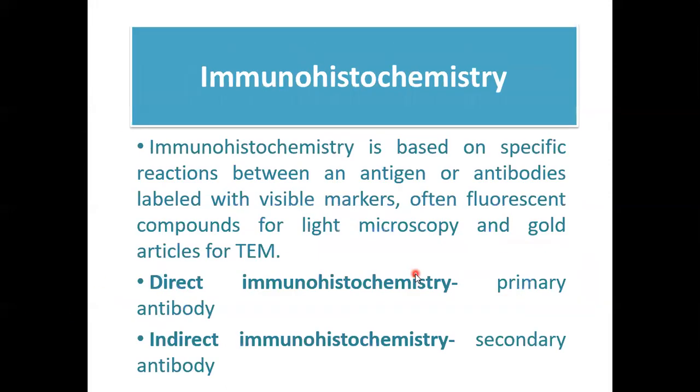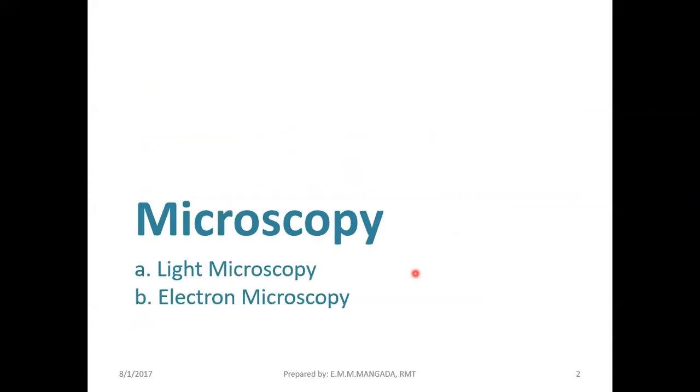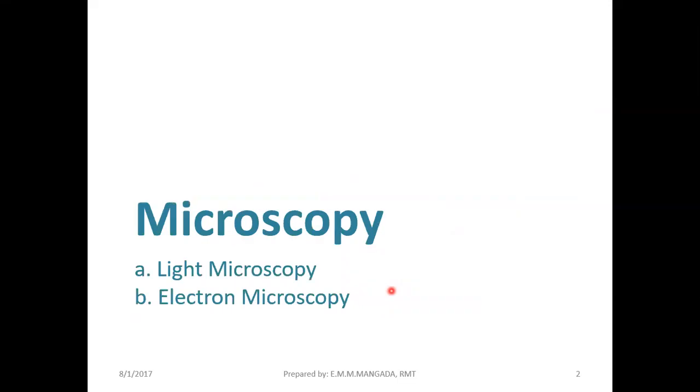Okay, so guys, now let's have a recap of the things that we have discussed. We have discussed the overview of methods used in histology. We have discussed microscopy. We have two types: the light microscope and the electron microscope. Under light, we have the different types like bright field, dark field, confocal, phase contrast, and the other counterpart, differential interference.